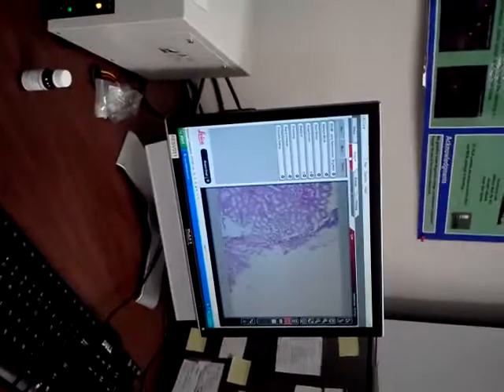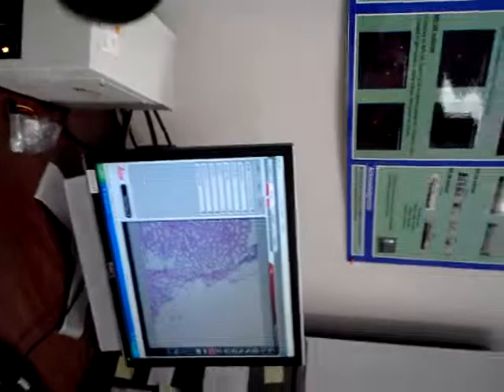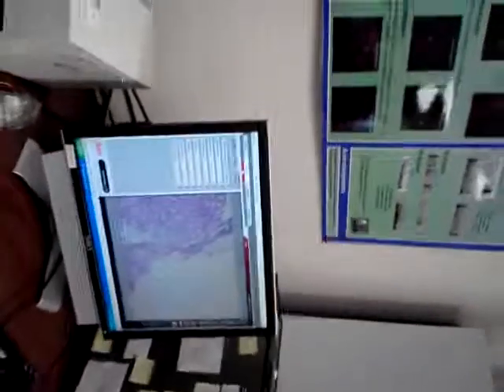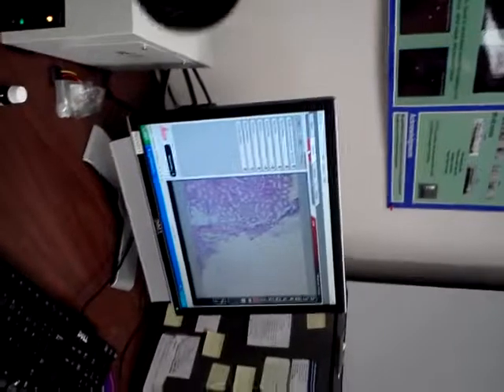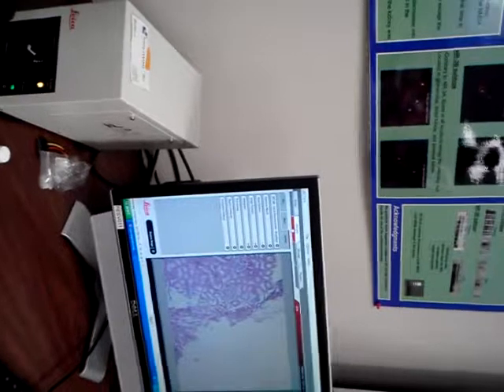Okay, well, this is great. Now, I have one more question. There's phase contrast. I was going to, and then I saw that. Did you see that? Yeah, I'll edit that in later. Delete the finger. Yeah, you can delete one of the fingers out of there.